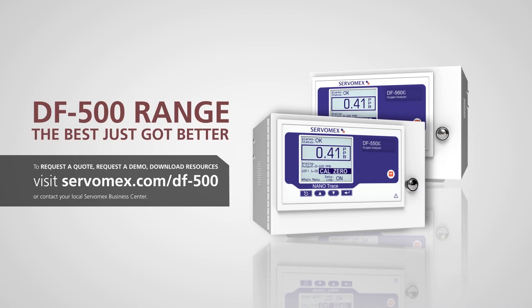The DF500 Ultratrace Oxygen Analyzer series. The best just got better.